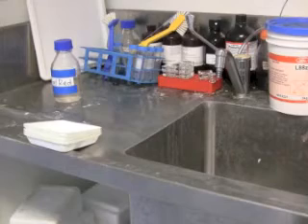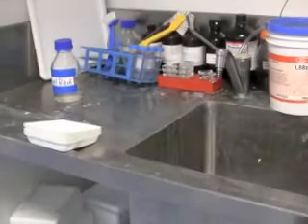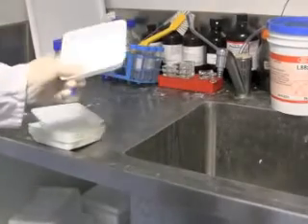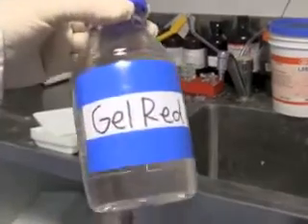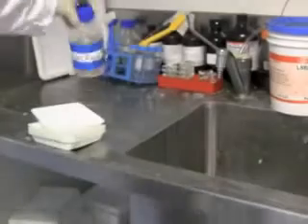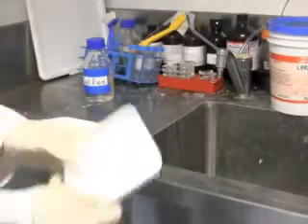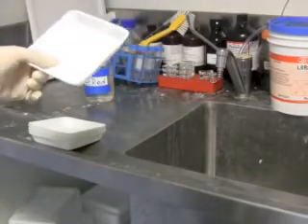Once your gel has finished running, you should glove up and come over to the sink where you will find these plastic trays. You will also find the stain. Please leave most of the equipment here — just pick up one of these plastic dishes and take it back to your gel tank.